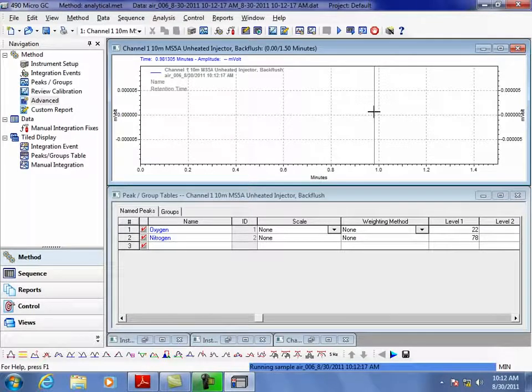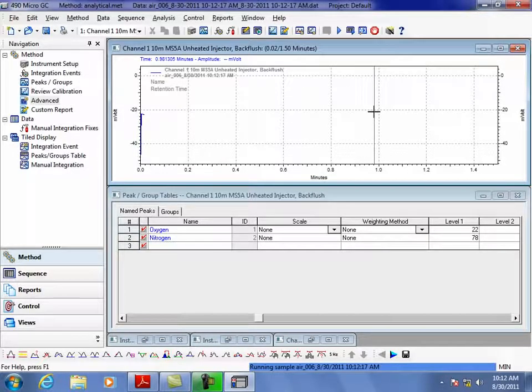What else do I need to show you guys? Are you going to be running... I don't think there's any reason, without having it automated or having a gas coming to it, to run a sequence. If you can figure out a way to come from your gasifier into the analyzer and then automatically sample it every so often, then I would build a sequence. But there's really no reason to if you're only running one gas at a time.